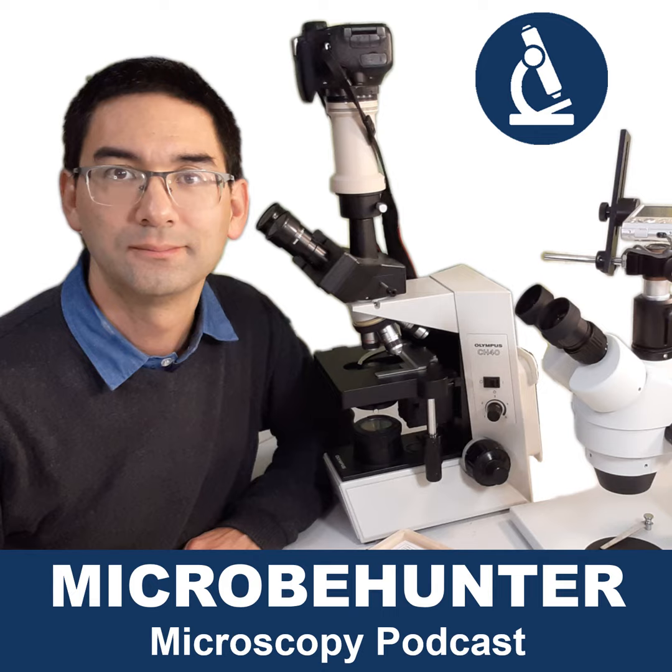Often the pictures that you get under the microscope are not as nice looking as a drawing, for the reason that there is a lot of dust that you see. Some parts are out of focus, and sometimes due to the sample preparation, some of the cells are also a little bit destroyed. So it's not always the case that you will get a perfect picture by using photographs.